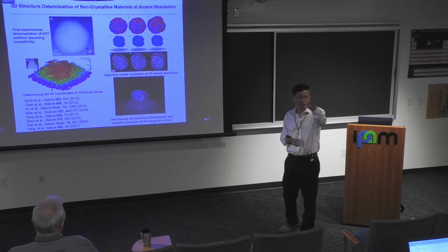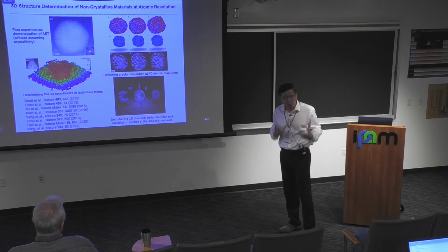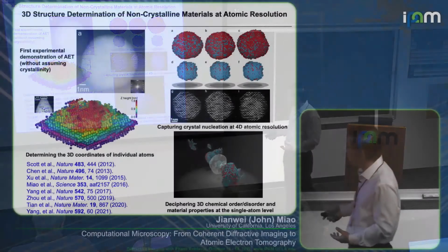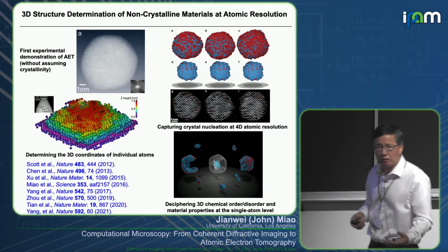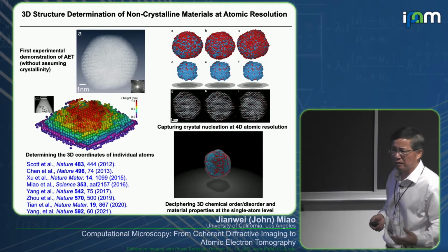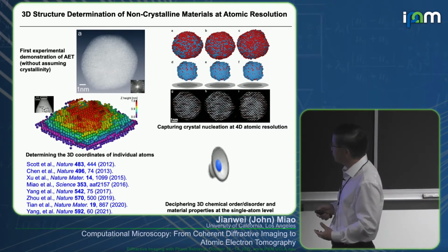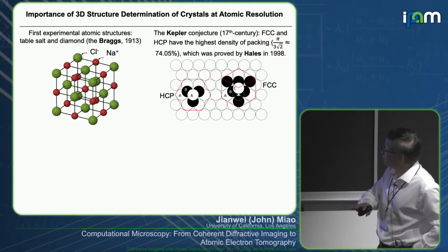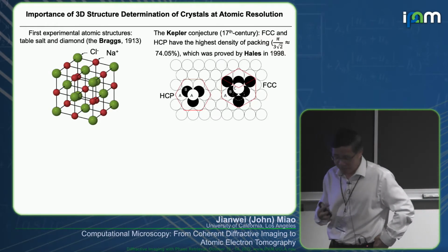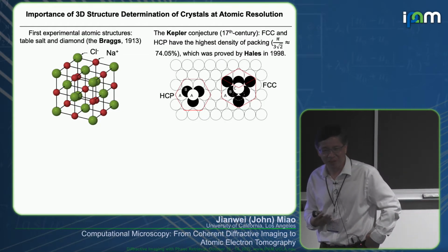Take glass, for example. What's the atomic structure of glass? People talk about it, but people thought it was impossible to solve. So we developed this, and continue to develop it, collaborating with Stan's group and developing new algorithms, and we push the limit to solve important problems. I'm going to show why this question was always in my dream when I was at graduate school: what are the amorphous material structures?